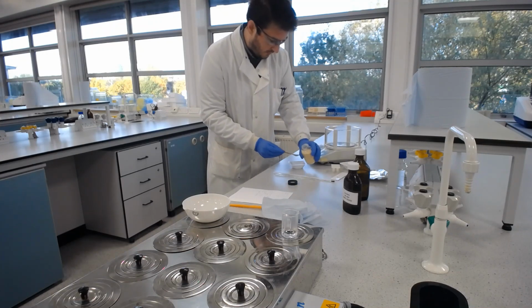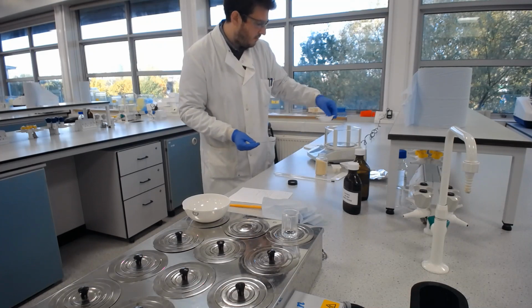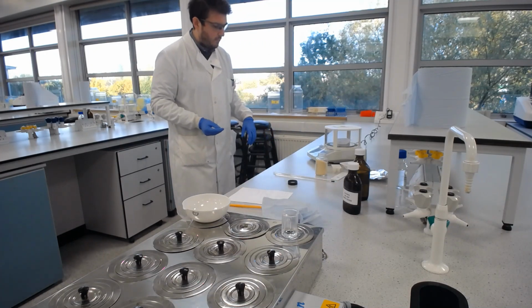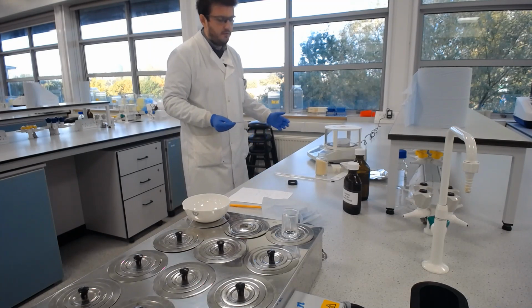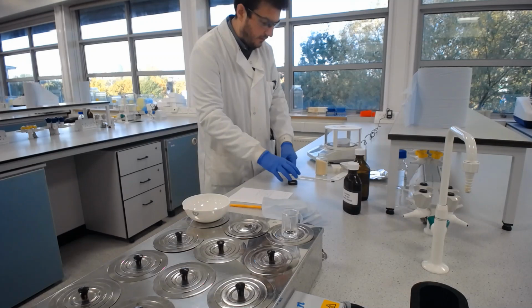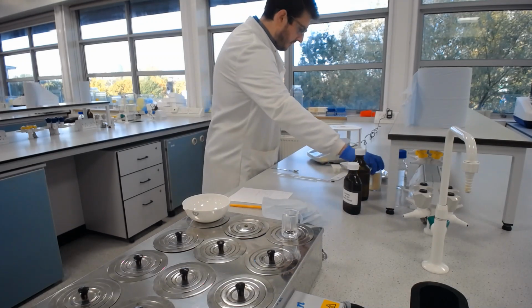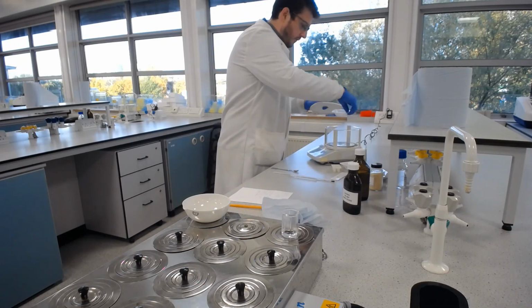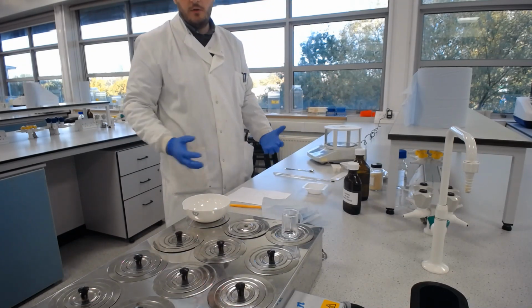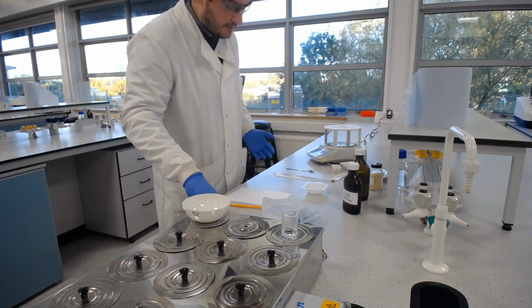Feel free to fast forward this bit. 1.595. That's within error for this balance. So we're going to say that's 1.6 grams. Put the lid on there. And we've got our gelatin. So the next stage is to mix the gelatin and water together, just like you would for making a jelly at home. This is exactly the same process.